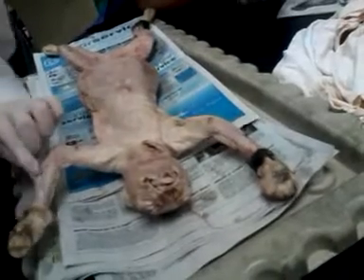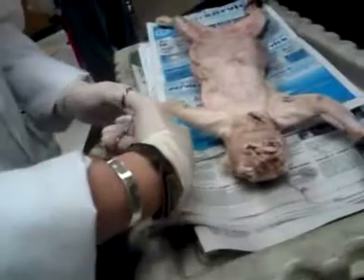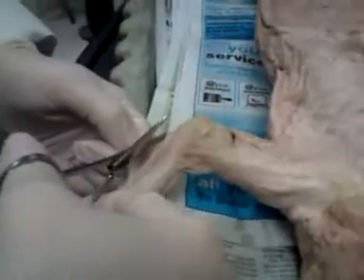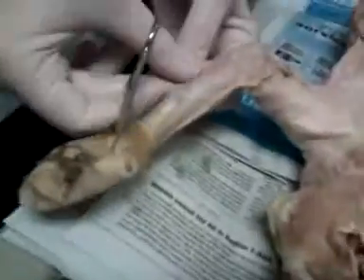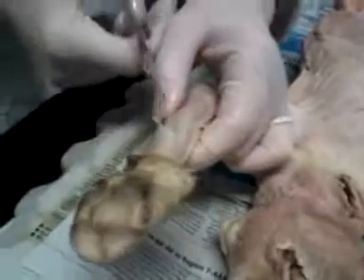All right. And then keep getting it off. Look at that tendon. Y'all see the tendon? No. Well, that's not. I take that back. That wasn't a tendon. That's just connective tissue. So you see how, now that I pull that off, you see those muscles underneath there? Mm-hmm. They're gorgeous.